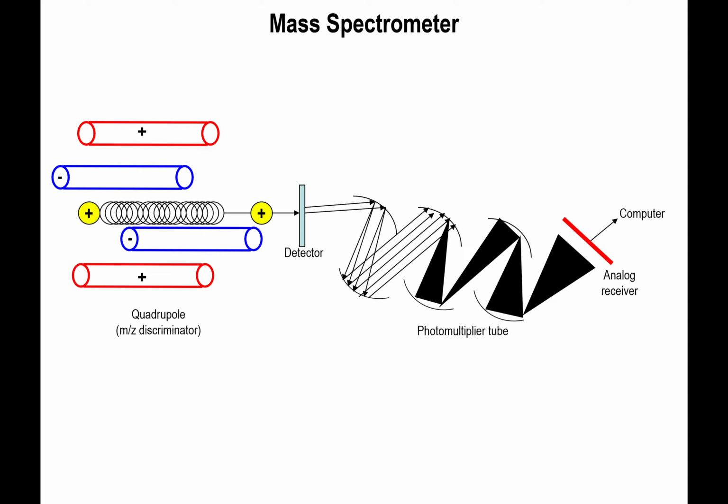And once you reach the detector, usually it is a metal surface that can easily lose electrons. And so when this particular cation reaches the detector, it basically collides against it. It's a big collision, and that collision has kinetic energy that is given to the detector and utilized to produce electrons. Pretty much, electrons come off the detector, which then are accelerated towards these voltaic plates of positive potential, and that collision creates more electrons that move over to this other voltaic plate of an even higher positive potential.